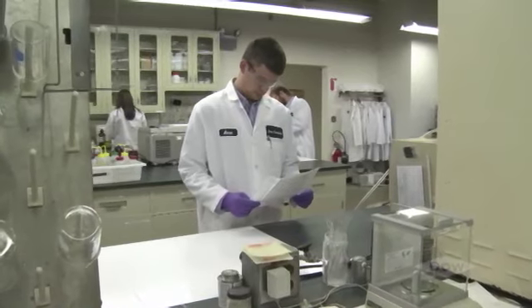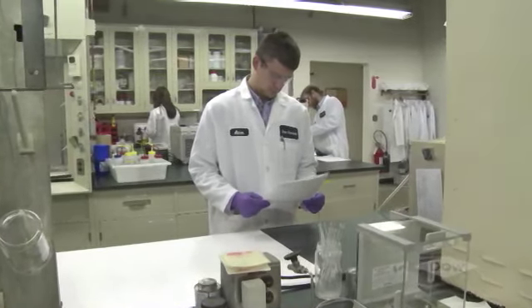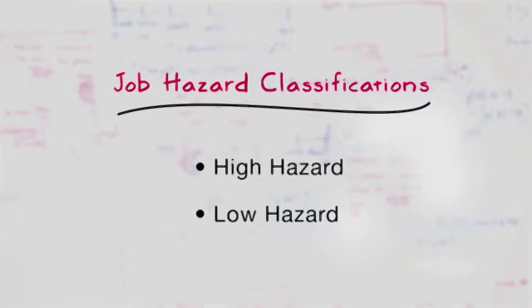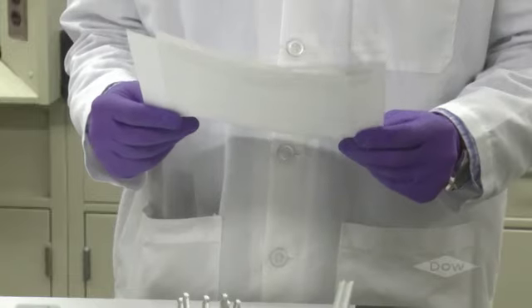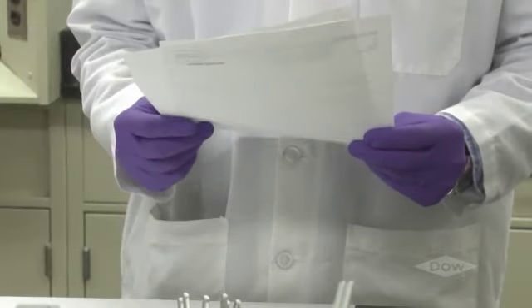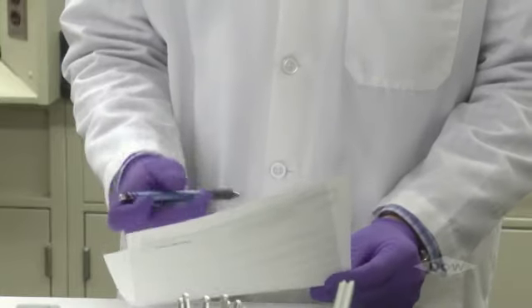First, he needs to really look at the work and its hazard potential. We classify jobs into two categories: high hazard and low hazard operations. This will make it easier for Aaron to make a smart decision about working alone tonight. Just from the name, Aaron can tell that high-hazard operations are those that could put him in a dangerous situation, not really what he wants or needs tonight, or anytime.